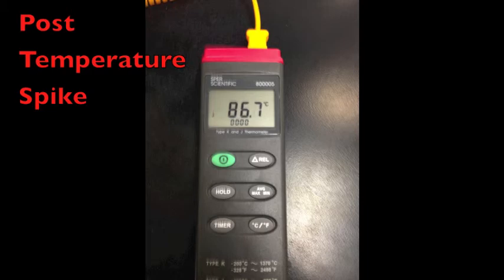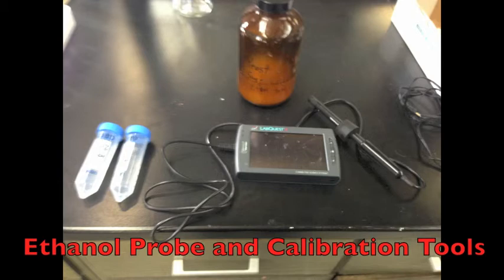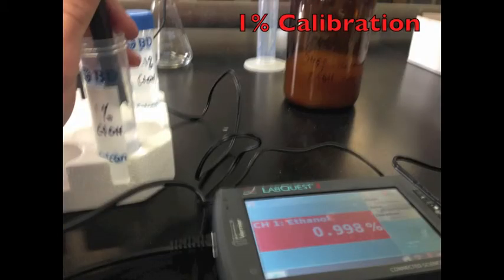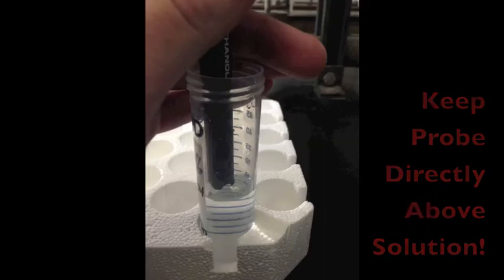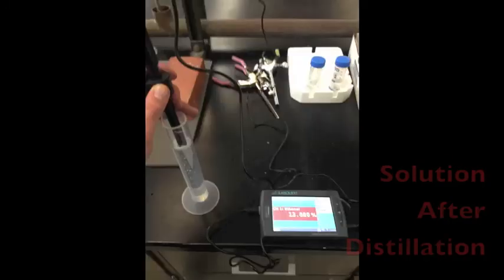After allowing the receiving flask to cool, ethanol concentration levels of the collected ethanol solution may be analyzed through the use of an ethanol probe, similar to the one shown here. However, before it can be used, it must first be calibrated with known ethanol concentrations. The pictures shown here are a common calibration technique. Note that the ethanol probe does not get inserted directly into the solutions. Once successfully calibrated, measure the ethanol concentrations of the ethanol solution before and after distillation.